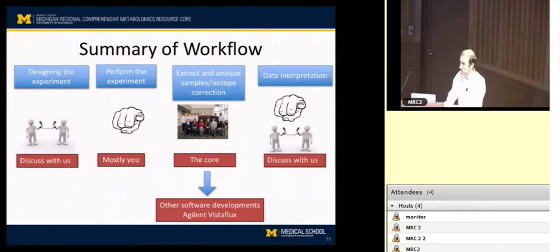In a typical flux experiment, would you completely exchange the carbon-12 to a tracer, or would you suggest a proportion? A proportion, right. So sometimes yes, sometimes no. For a simple study, if you're going to follow the workflow I showed you, doing transient labeling and looking for incorporation over a time course, for a first approach I would recommend, in general, a complete exchange of media.